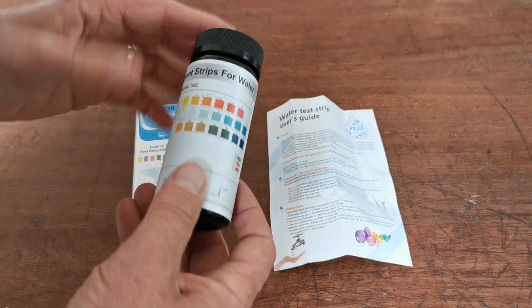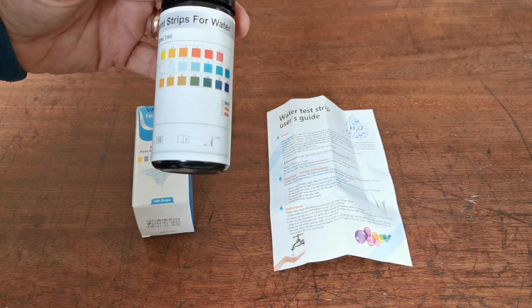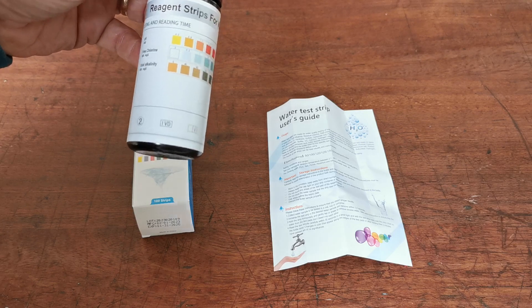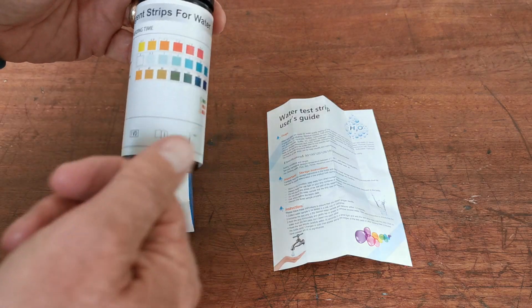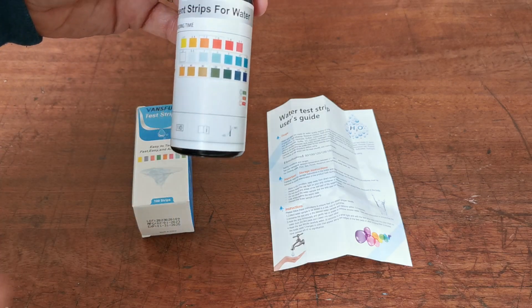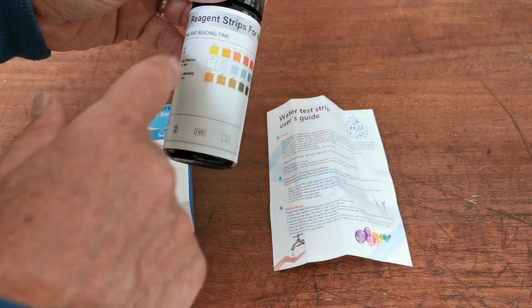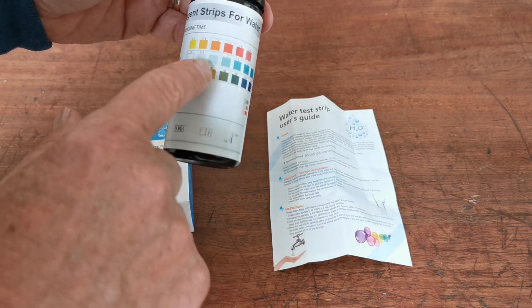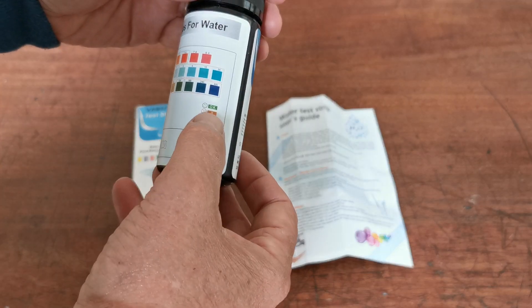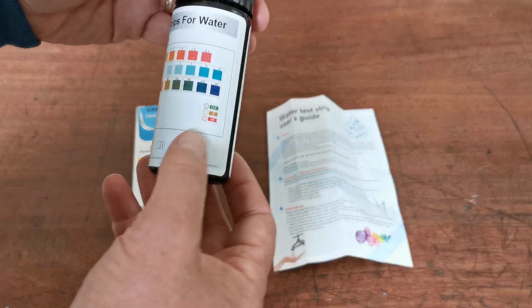So what do you test and how do you test it? It's a simple dip test — three pads on each strip and a simple colour comparison against each one. You've got pH: they've usefully put a green box around the ideal spa pool and swimming pool pH range. Same with free chlorine — you've got low, good, and high levels indicated by green boxes. So you've got green for okay, amber for alert, and red for warning.